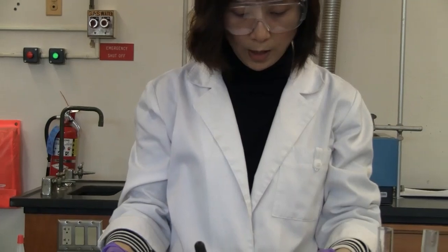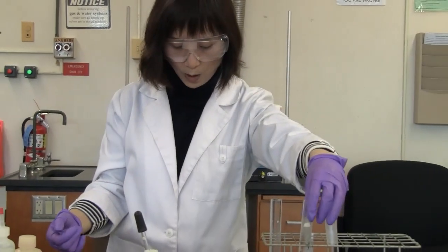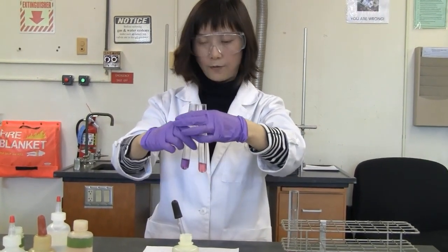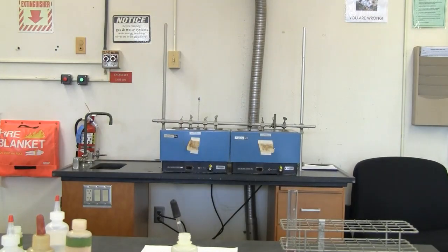Now, step 5, cool the test tube under cold water tap and indicate the color after the change. Okay, I'm going to cool it down with water.